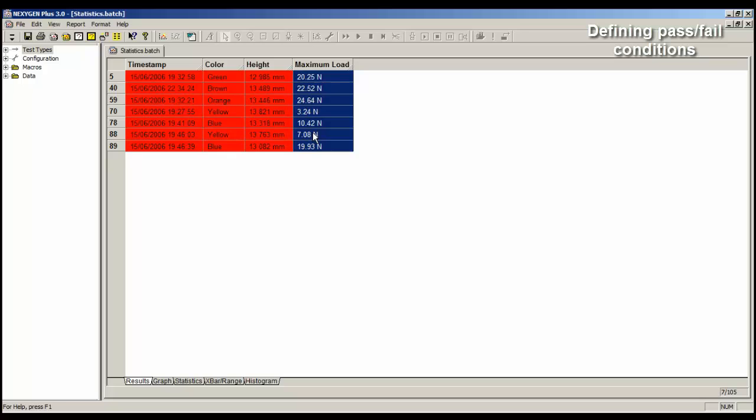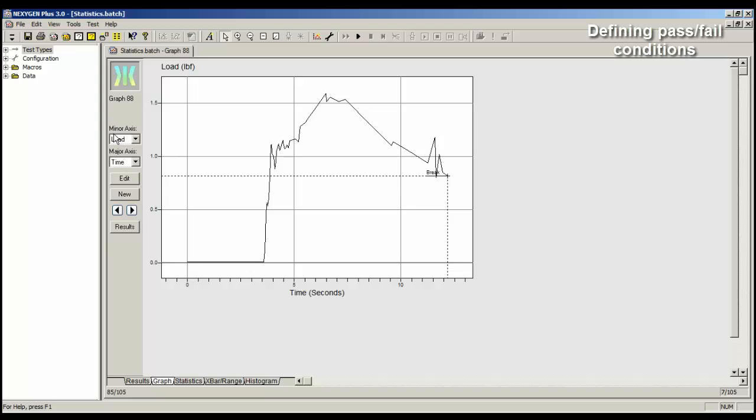To look at the graph of any of these tests, let's say test number 88, double-click on the 88 to display the graph. The left-hand side here shows a legend. It's telling me that I'm looking at graph number 88, and here we have view the previous graph, and view the next graph.